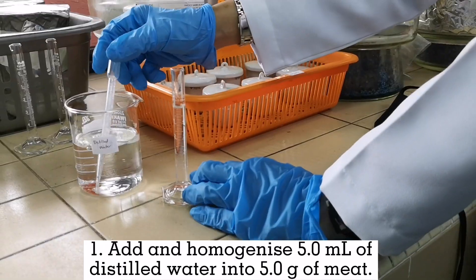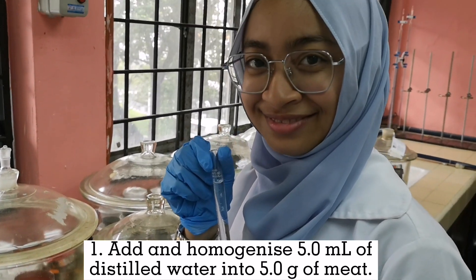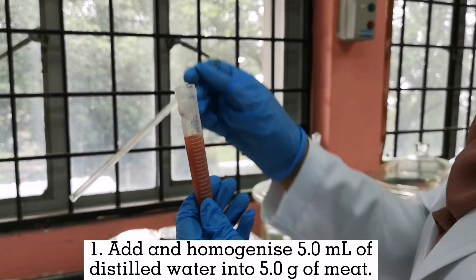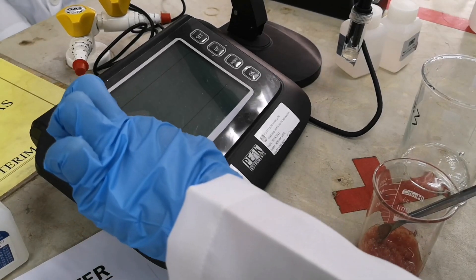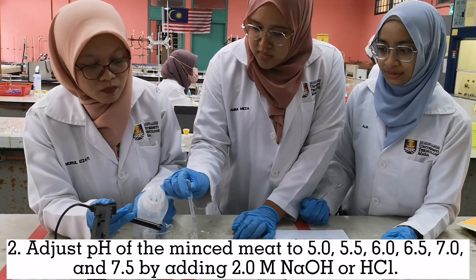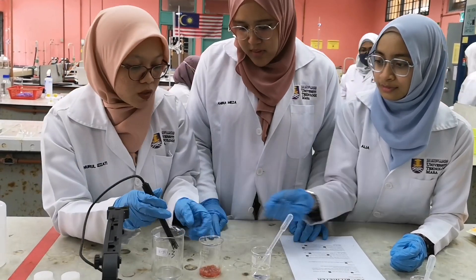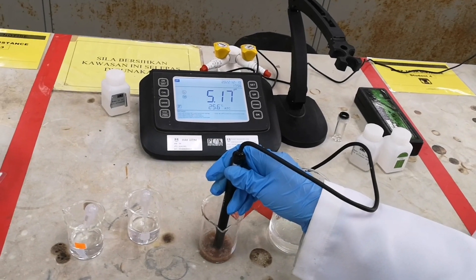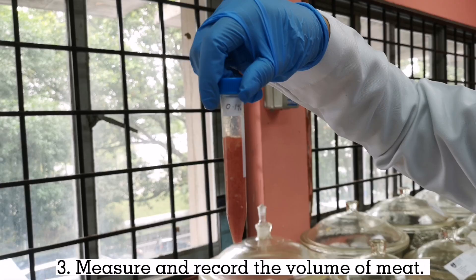Add and homogenize 5ml of distilled water into 5g of meat. Adjust the pH of minced meat to the following pH by adding 2 mol sodium hydroxide or hydrochloric acid. Measure and record the volume of meat.